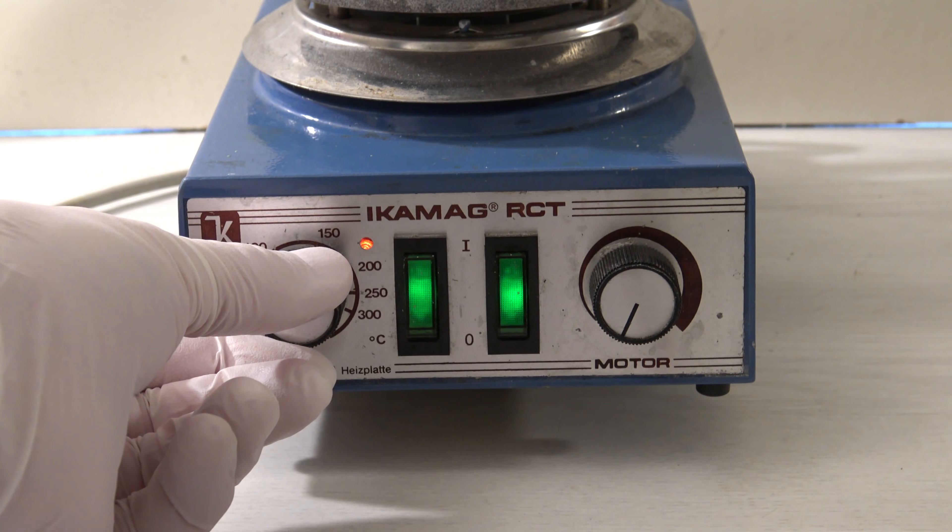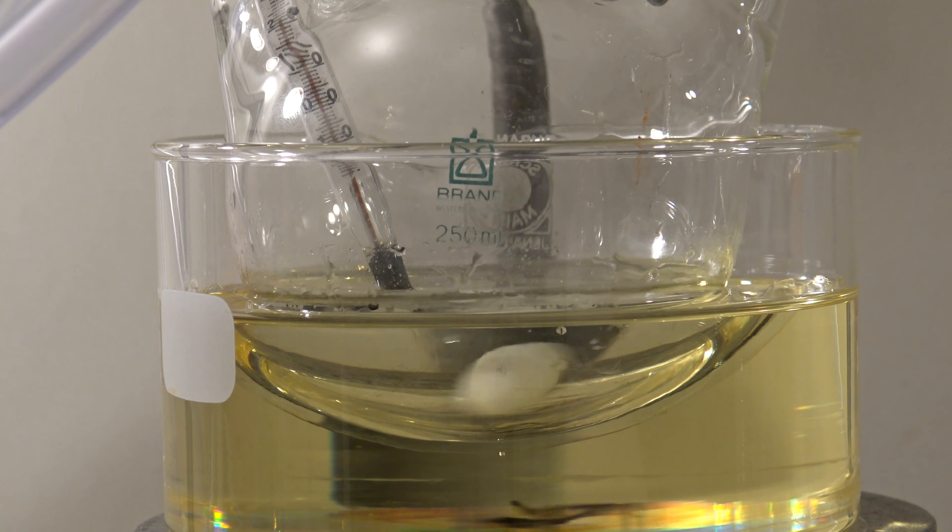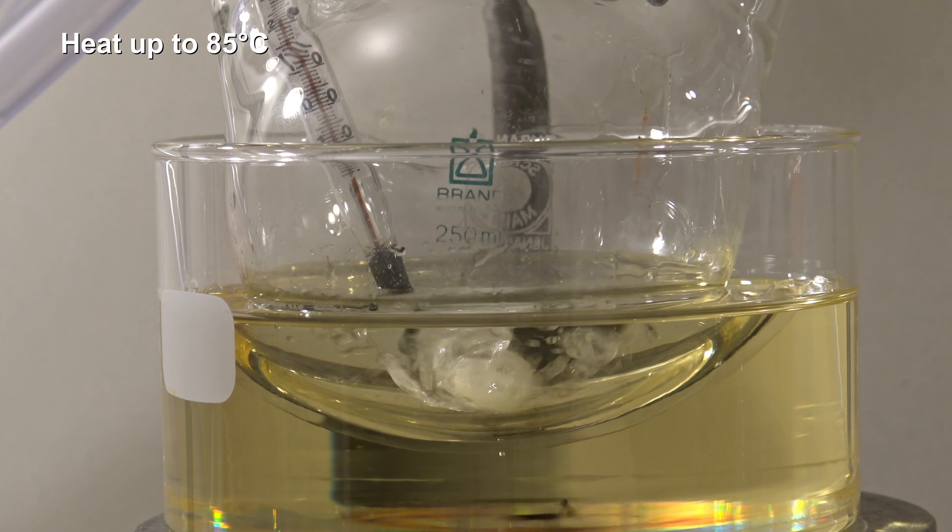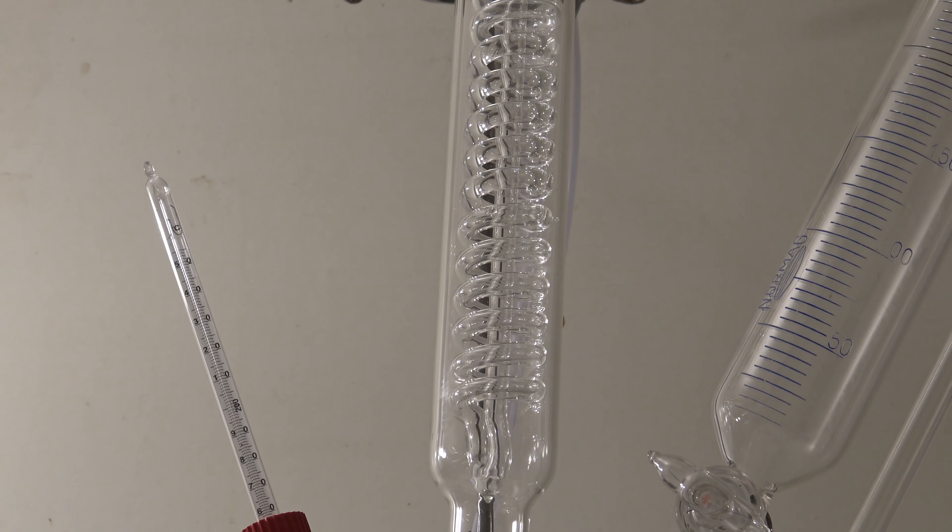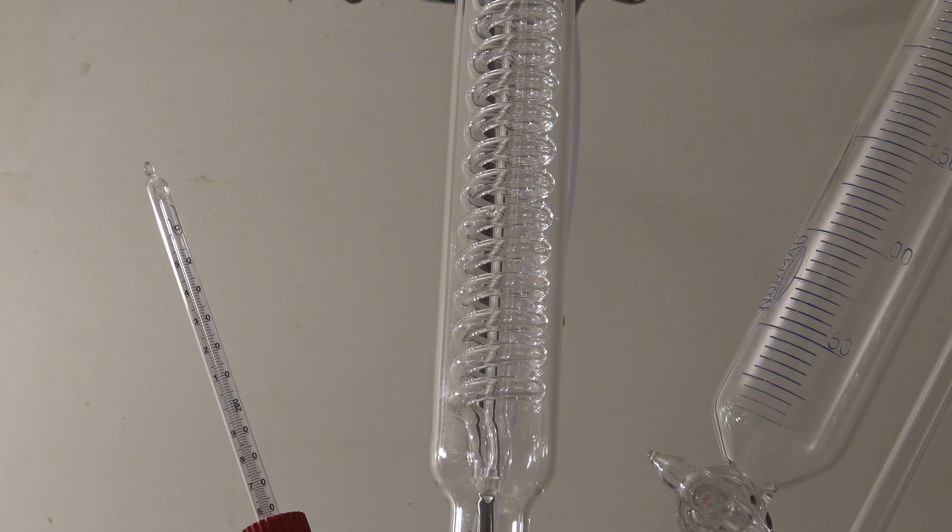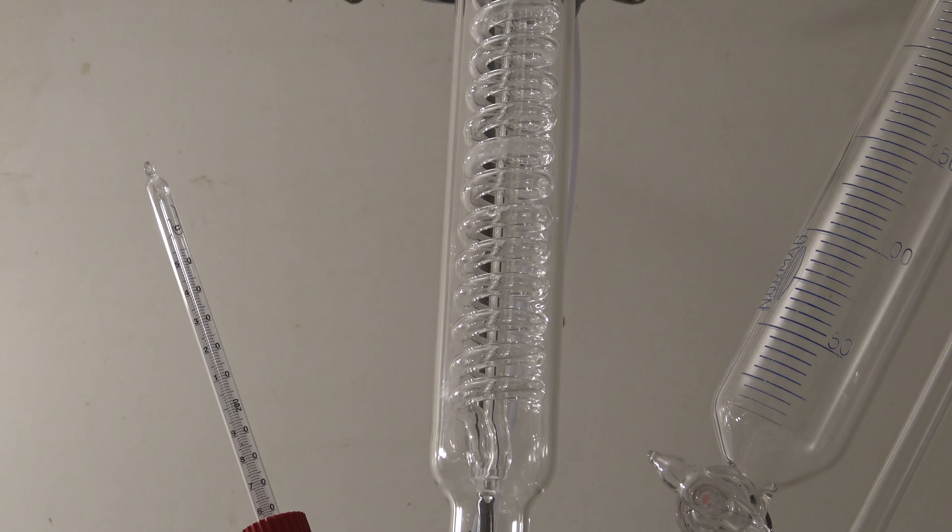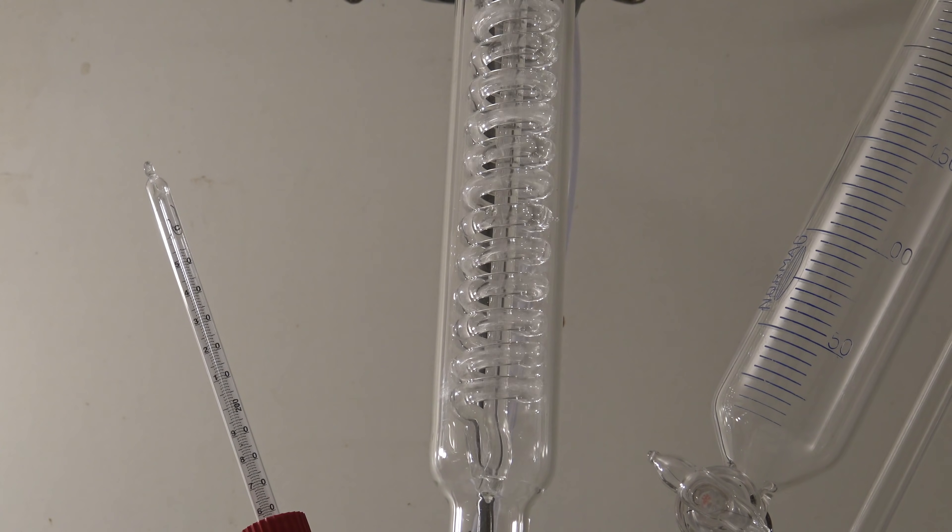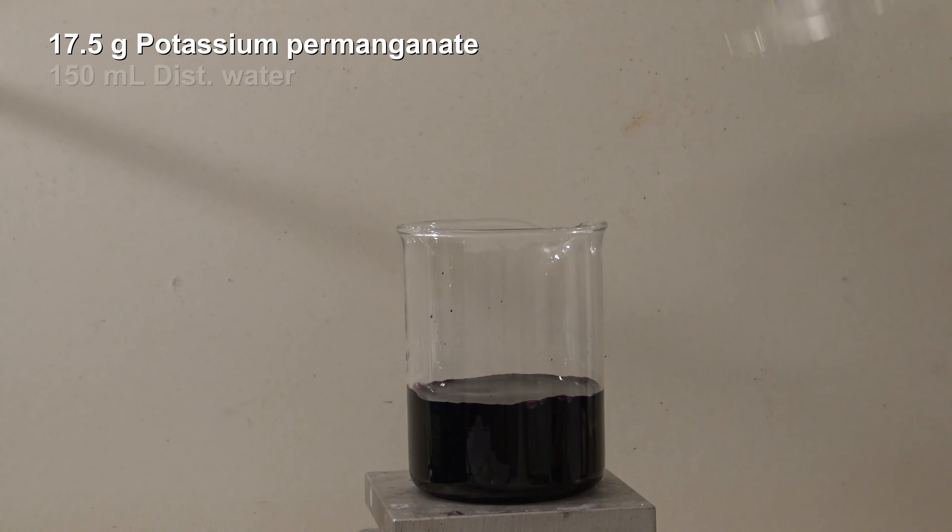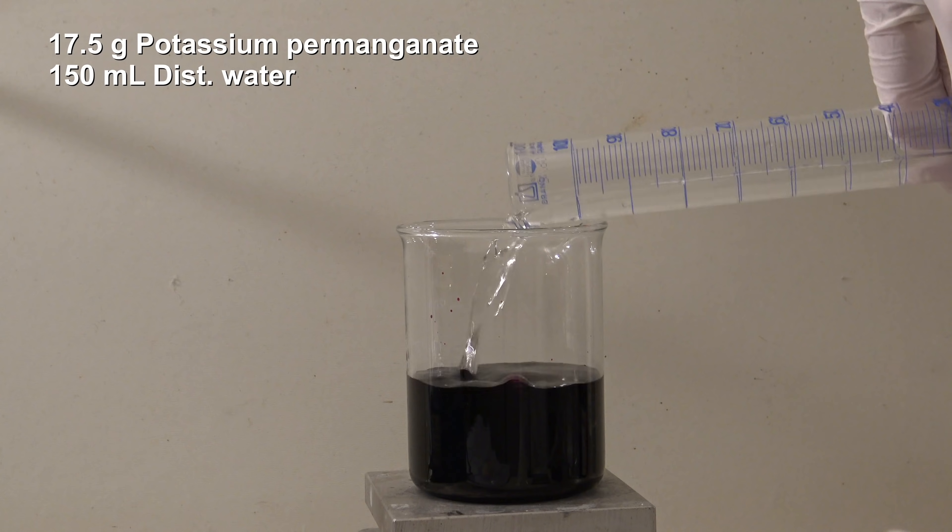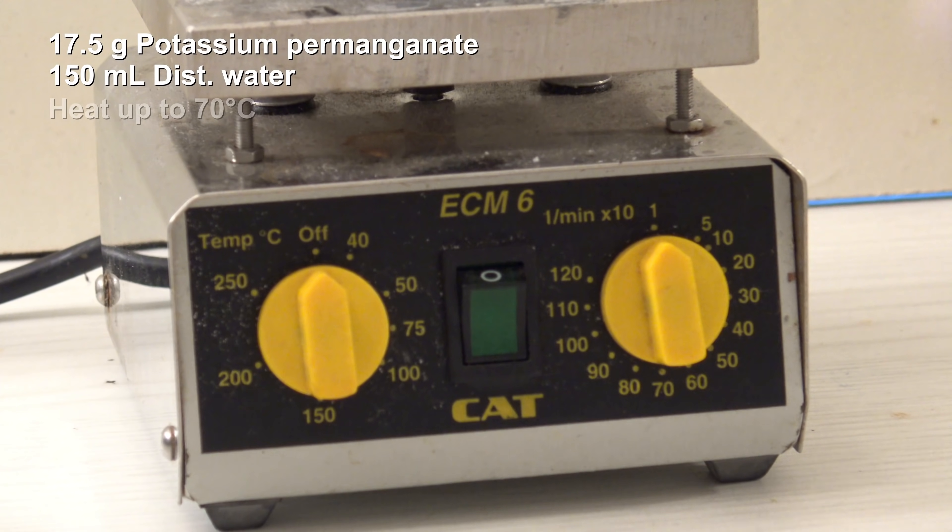The mixture in the flask was then heated to 85 degrees Celsius. In the meantime, 17.5 grams of potassium permanganate were dissolved in 150 milliliters of distilled water and heated up to 70 degrees Celsius.